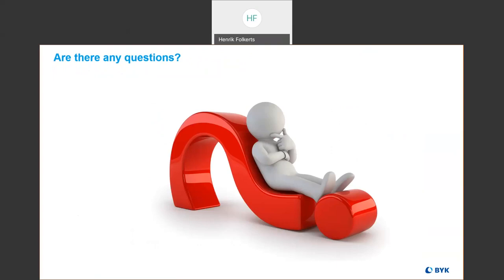Now your questions. So I have a question here. Can the Duro test be done on a curved surface? Yes, this is possible. This is one of the advantages of the Duro test.